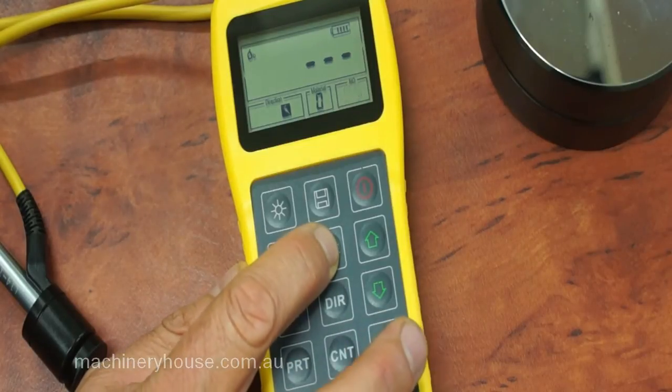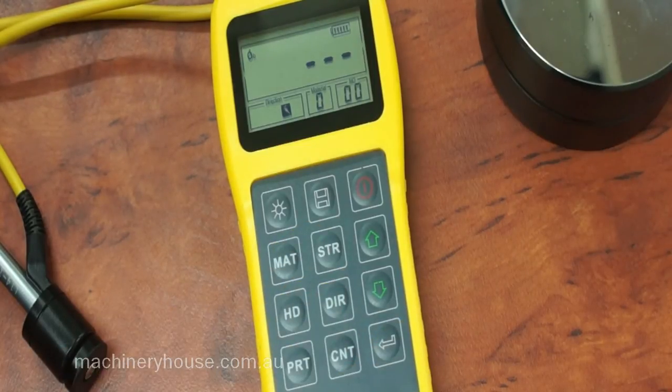The strength button will allow you to toggle between hardness test and tensile strength.